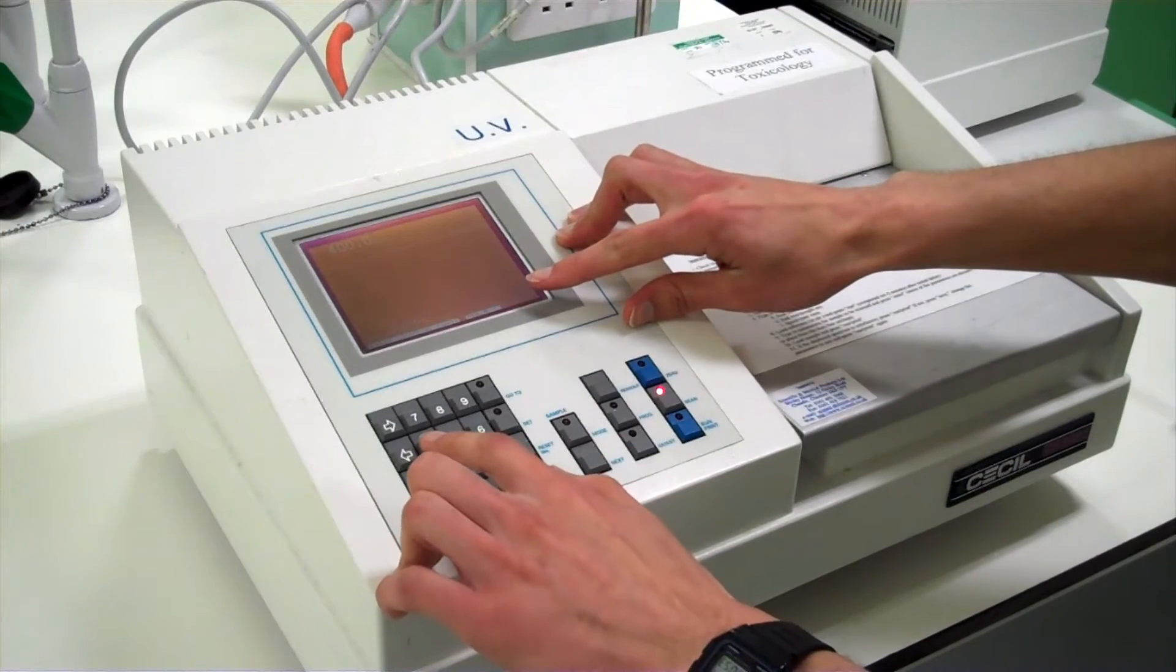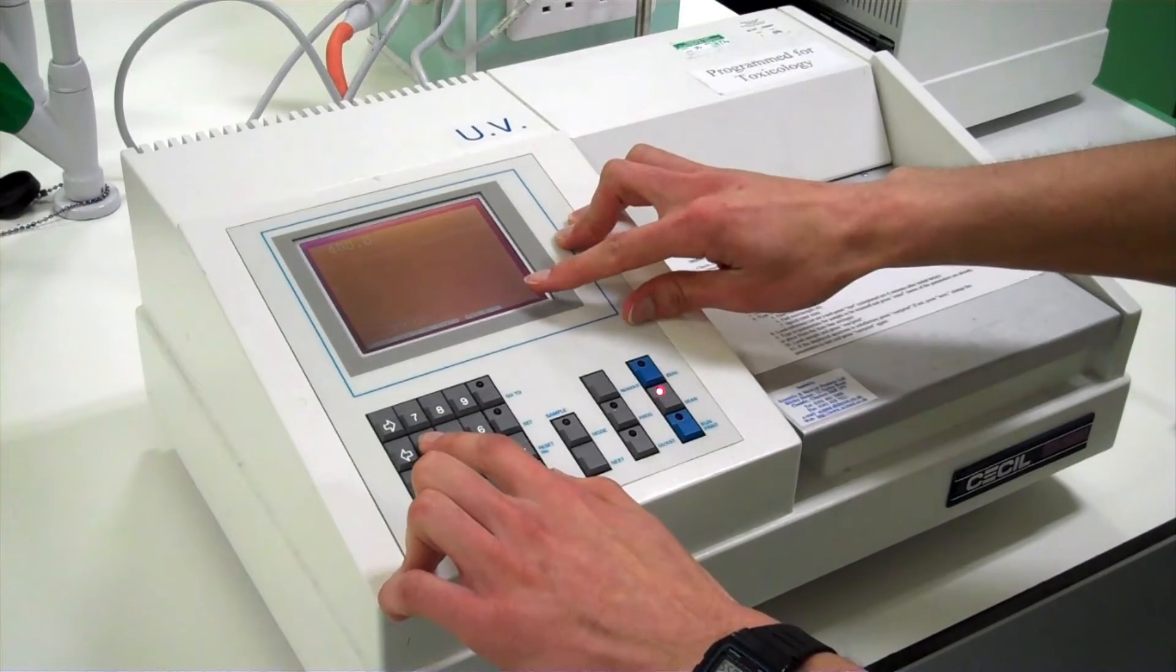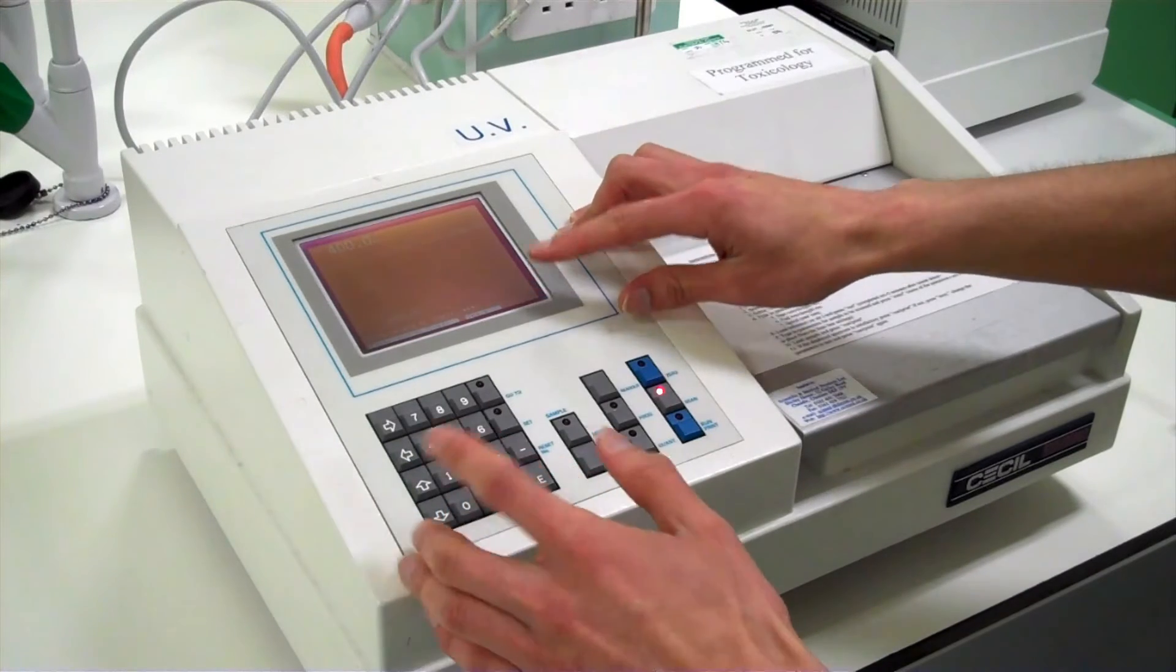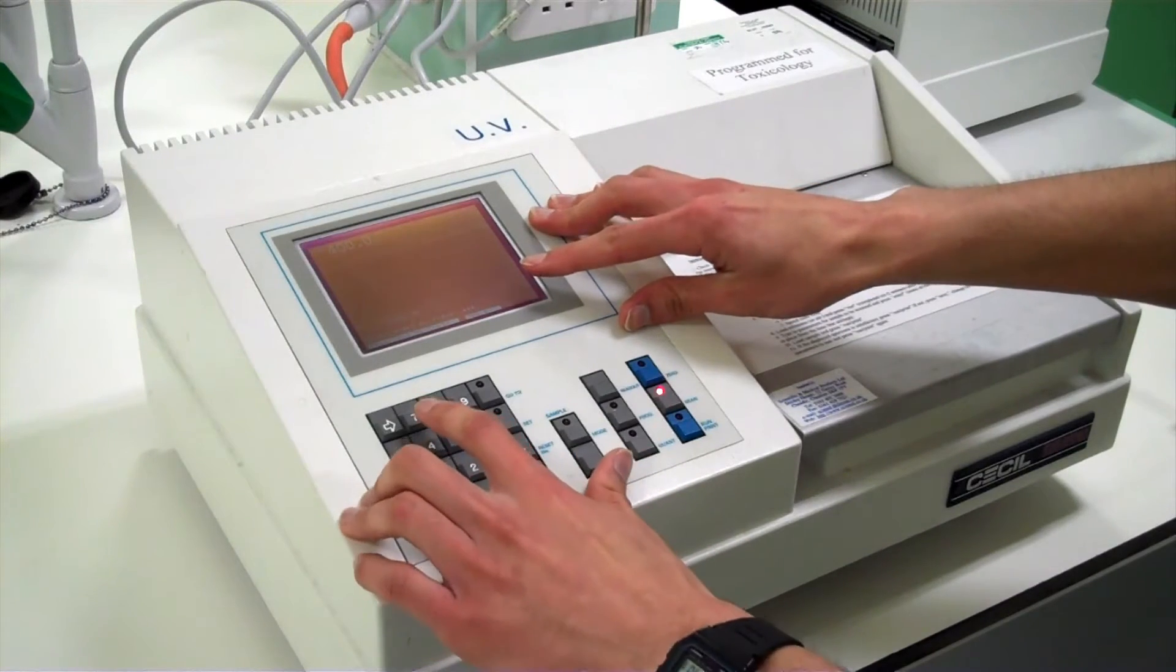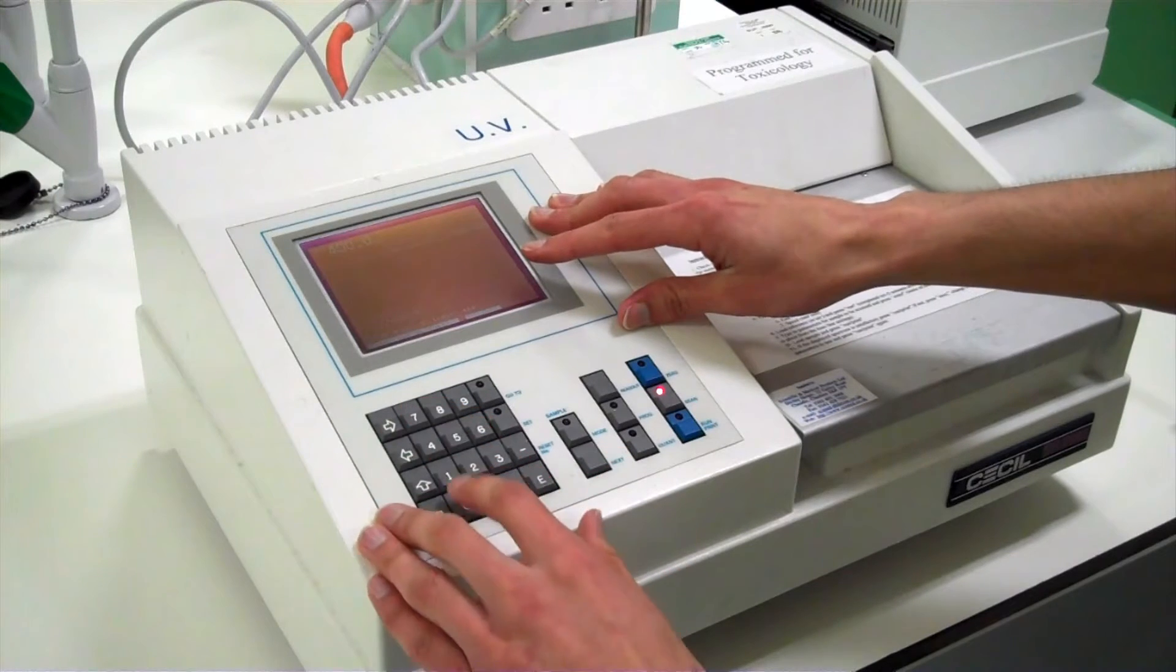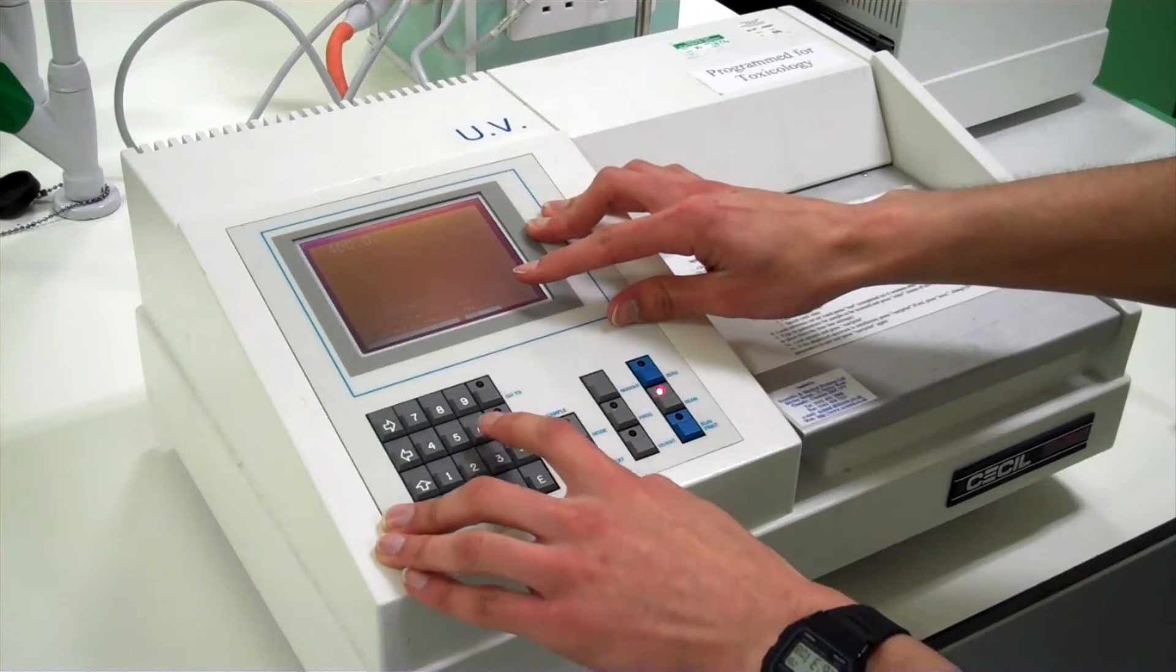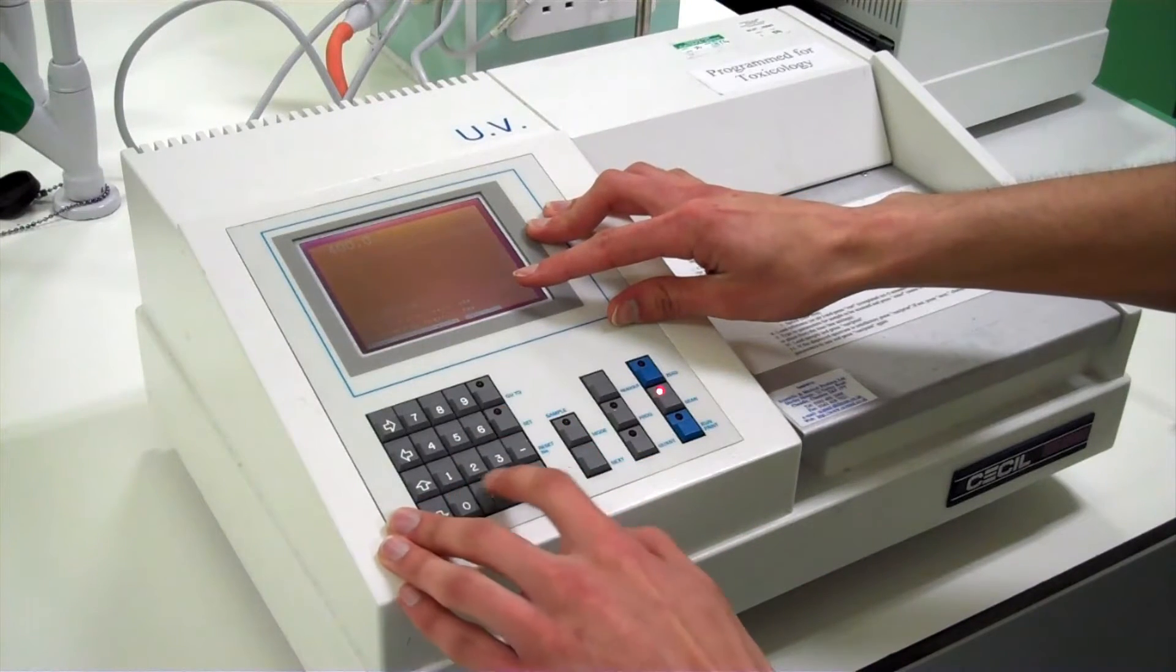We then enter the parameters. The wavelength we want the scan to begin with is 400 nanometers and enter. The wavelength we want to end our scan with is 700 nanometers. Press enter and the speed 600 nanometers per minute and enter again.